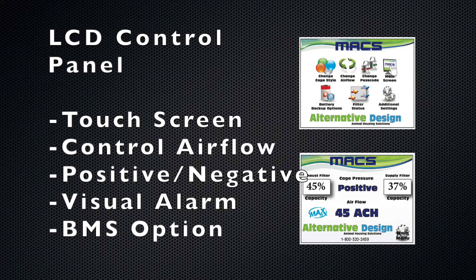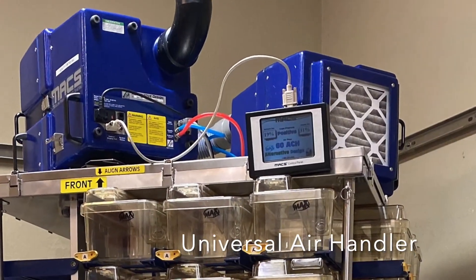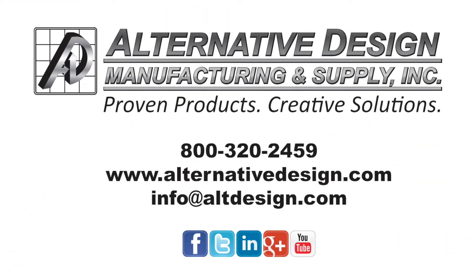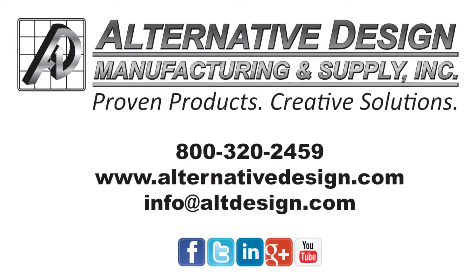The Rotary utilizes a seven-inch LCD control panel. This has been an overview of a Rotary unit — for more detailed information, please contact us.